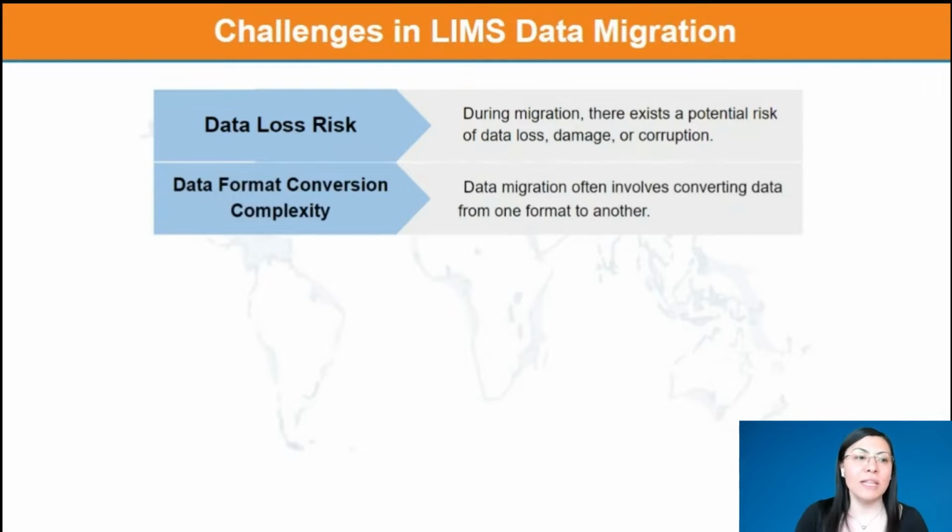The data format conversion complexity. When we are talking about two different LIMS interfaces, we will notice that they don't use the exact same format. So we have to be very careful here as well, because we want to be able to retrieve and access data from one system to another.